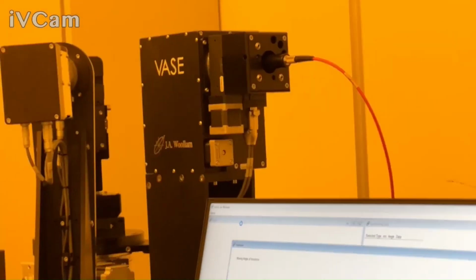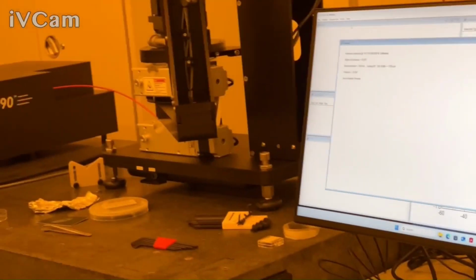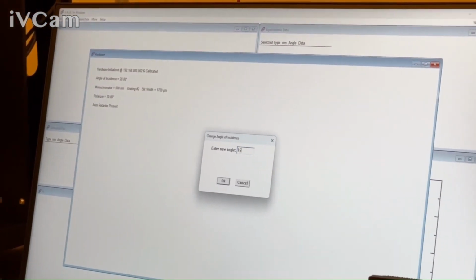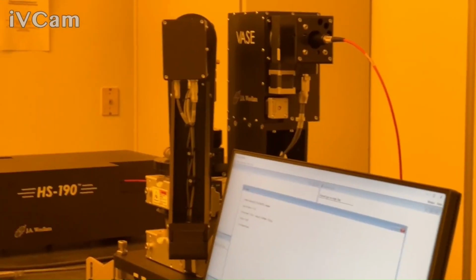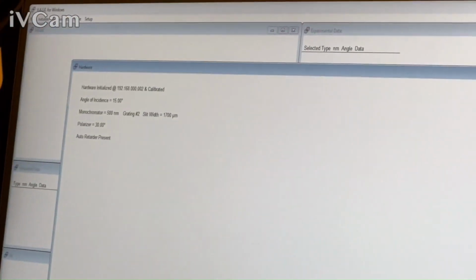There's a limit sensor. Basically here, if we go too low, I think I can go to 15. We're gonna try it. Yeah, so you might be able to go 12. I'm not gonna push it, because if we hit a limit, we have to reset the goniometers and stuff. It's not that hard, but you've got to loosen these and move them around and reset where the scales are. It's in the manual. I can look if we can go further, but I'm not going to push it further than that right now.